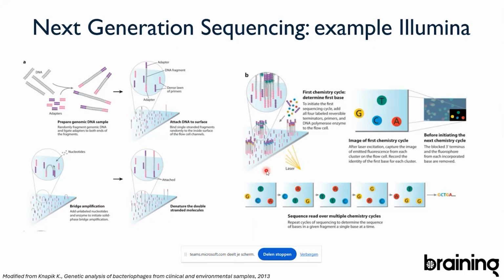Then there is a chemical step in which the fluorescent label is removed, and the base is then modified to allow the DNA polymerase to incorporate another base. So it's basically a chain termination reaction, but one that is reversible. And so one by one, after every chemical step, you have the new incorporation of another base. And that's basically how you determine your sequence.